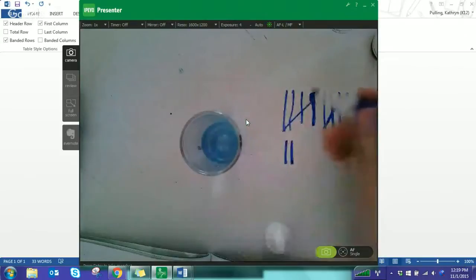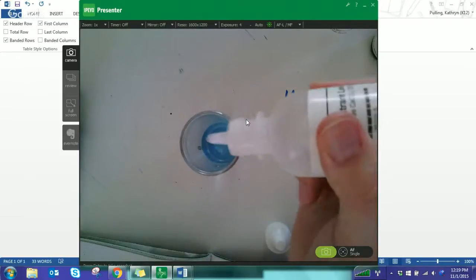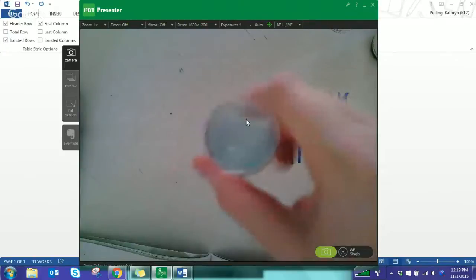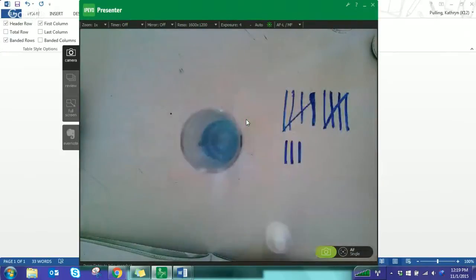So this part is definitely going to be the longer part of the lab. All right, and you just got to keep doing this until it turns red. And I haven't done it before, so I have no idea if we're close. I feel like we have to be getting pretty close.